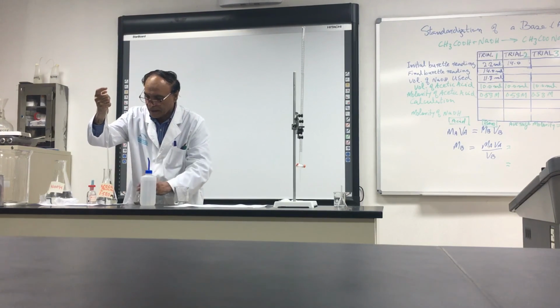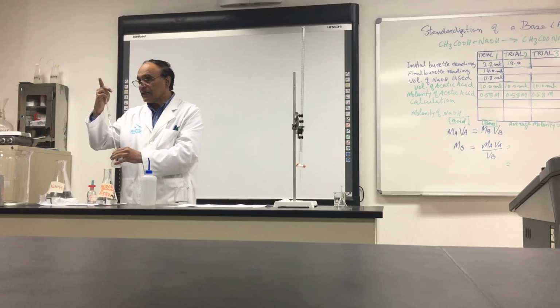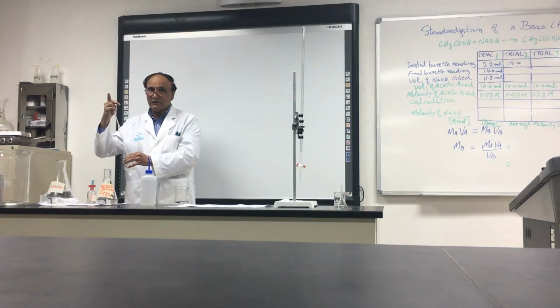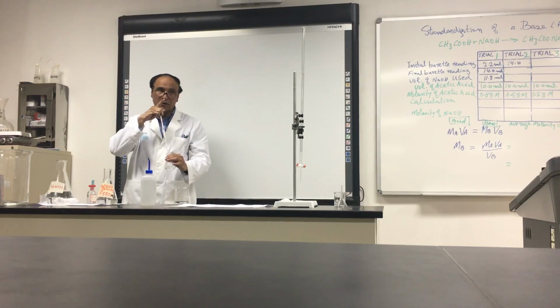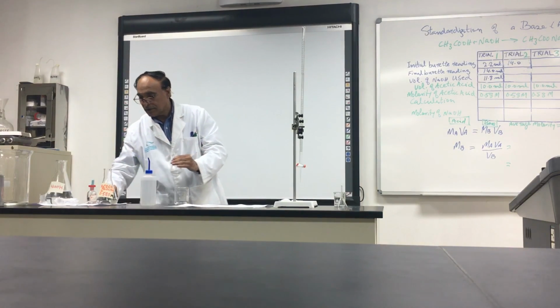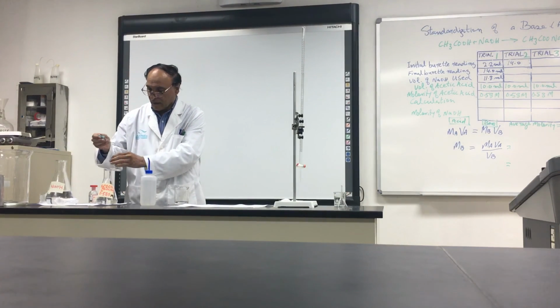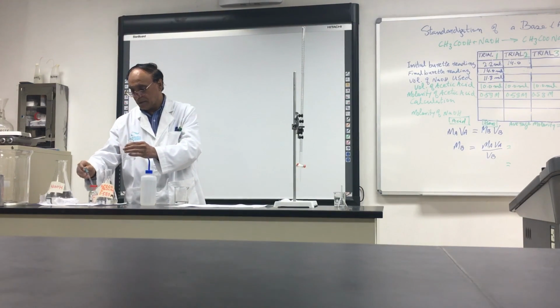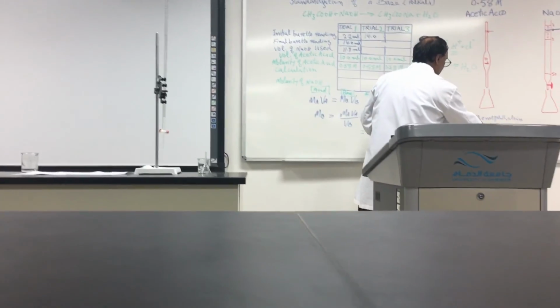Hold it exactly, and this is very near to you because I have experience. I can do it in one time. If you don't have experience, you try it, maybe it will take 5 times, 6 times. Don't worry. Don't blow it. And don't forget to add the indicator, because if you forget to add the indicator, your end point will not come. How many drops? 3 drops. Phenolphthalein indicator.